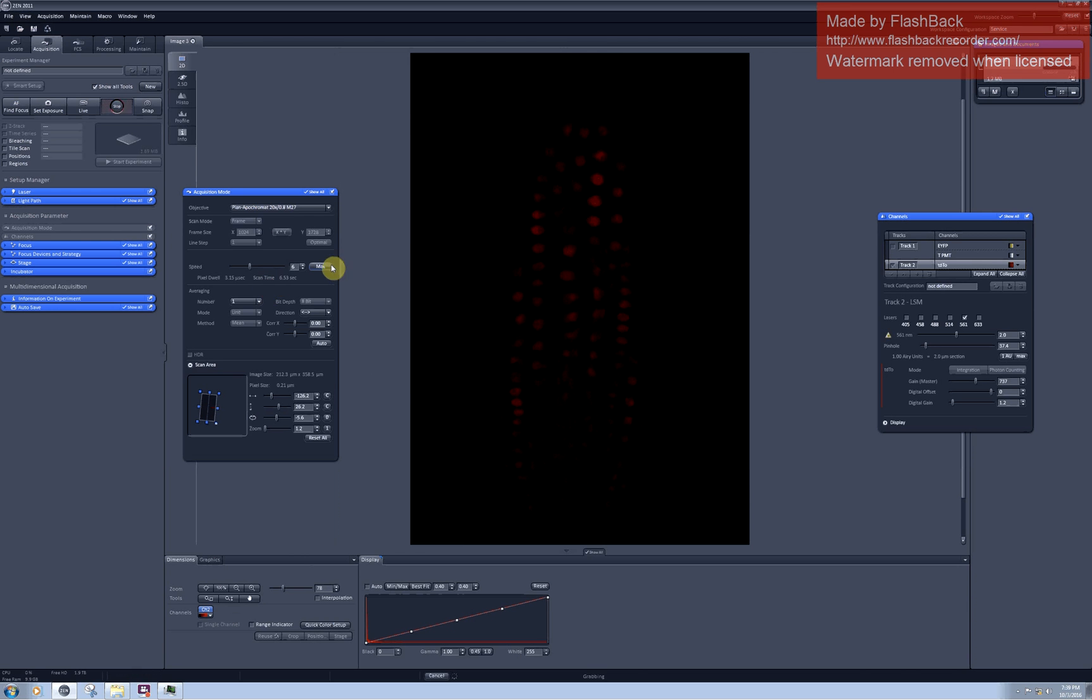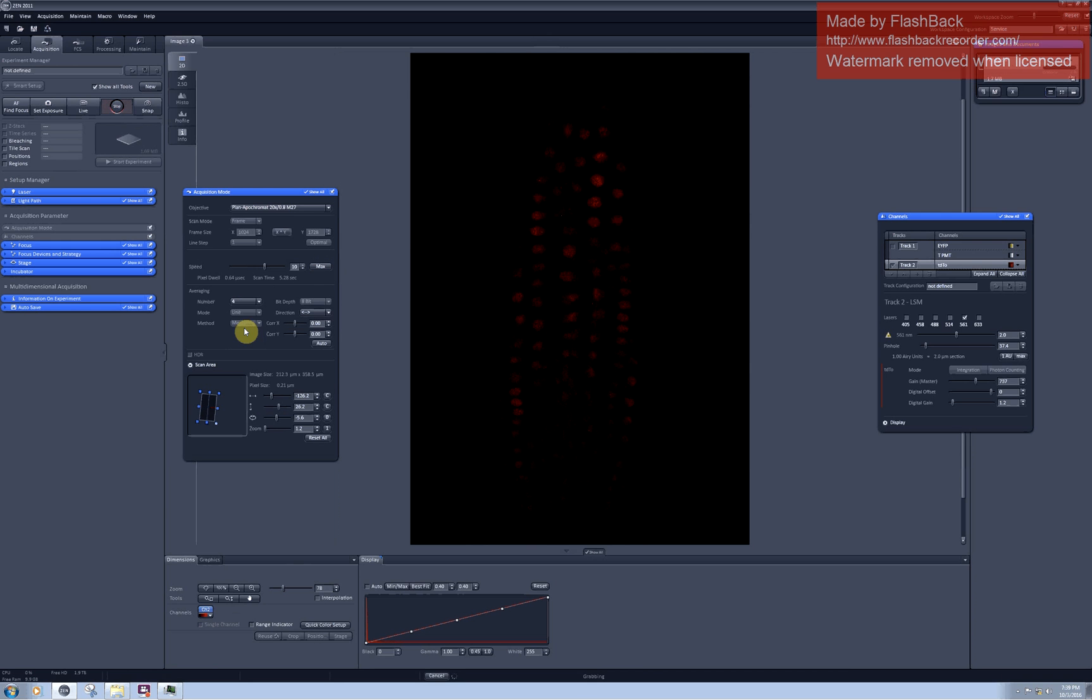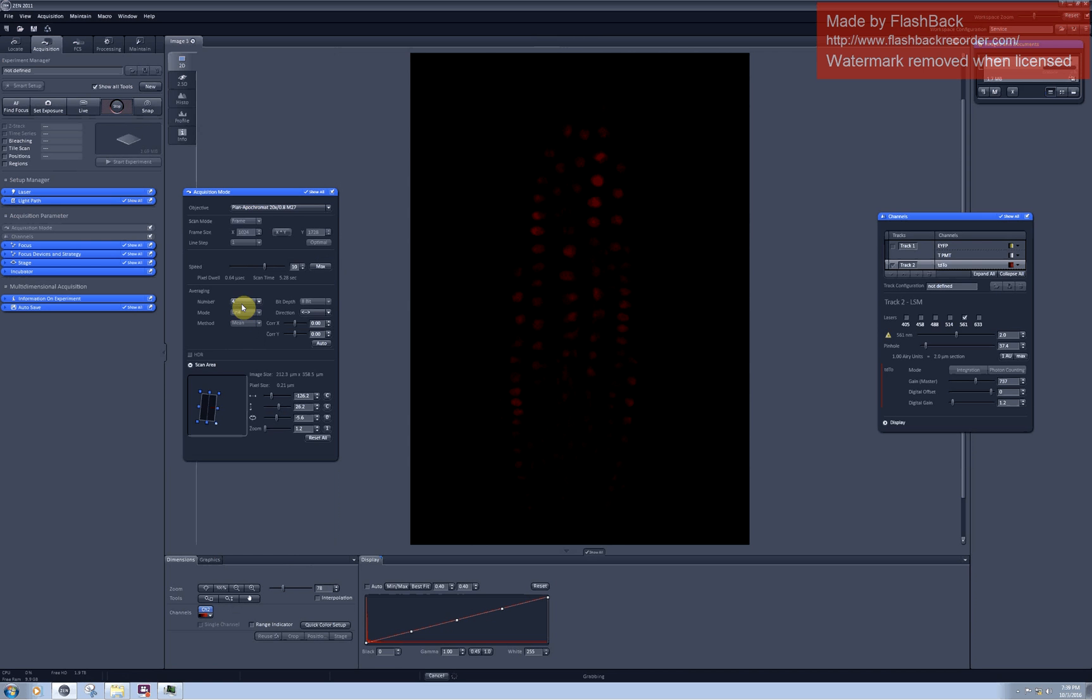On the other hand nothing here is moving, this is stained nuclei, so what I can do I can try to figure out whether averaging will actually give me the same quality of image with lower scanning time and maybe it does.